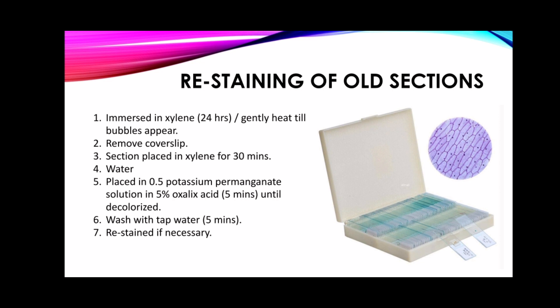In re-staining of old, bleached, or faded sections, the slide is usually immersed in xylene for 24 hours or gently heated until the mounting medium begins to bubble. The cover slip is then removed by lifting with a dissecting needle. The section is placed in xylene for 30 minutes to remove remaining balsam and brought down to water. It is placed in 0.5% potassium permanganate solution for 5 to 10 minutes, rinsed in tap water, then immersed in 5% oxalic acid for 5 minutes or until decolorized. After washing again in running tap water for 5 minutes, the section may then be re-stained with the appropriate staining technique.